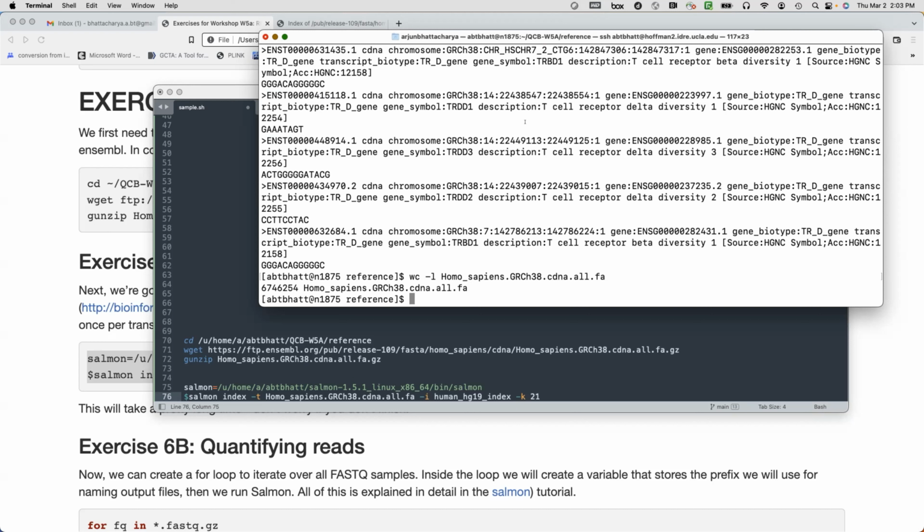what if we don't have a good reference? Can we do de novo assembly of a transcriptome? The answer there is yes, and oftentimes there's a reason to run a de novo assembly of a transcriptome, but having the map of the reference genome really helps in that setting. Say you're interested in a specific gene that you believe to have a bunch of transcripts that are specifically expressed in, say, differentiation of a neuronal cell.